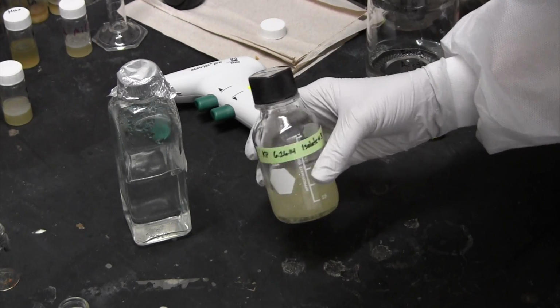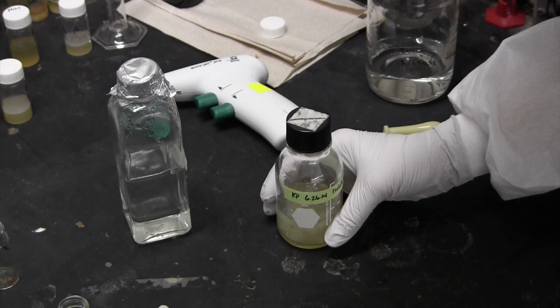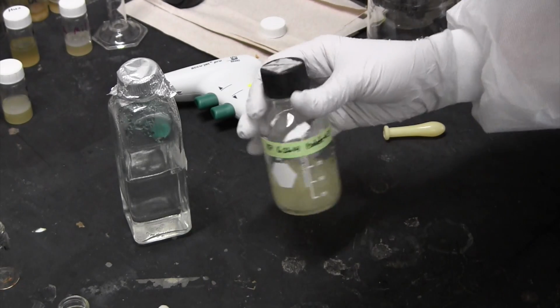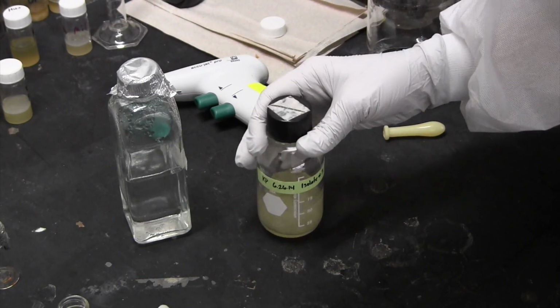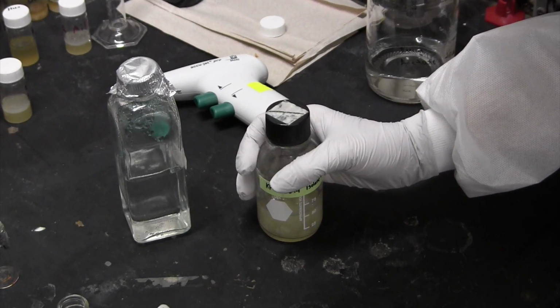And at that point, we will pull off our extract and look at the 2 different layers. If you also have an extended period of time where you may not be able to get back to your chem extract, you could also store this in the -20 or in the refrigerator, wrapped in aluminum foil to prevent any form of oxidation. Great. Yep, that's absolutely true. So if you need to figure out a buffer in terms of your scheduling, you can just pause everything by freezing it. Thanks.